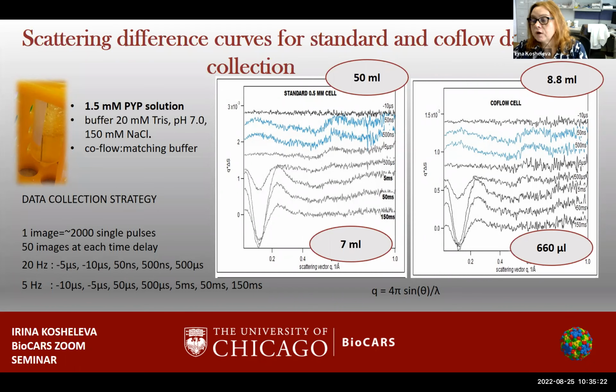Once the sample passes through the flow cell, it is diluted. So if you need to recover the sample, the only way is to reconcentrate it. Otherwise, the sample concentration will be different on the output of this flow cell.